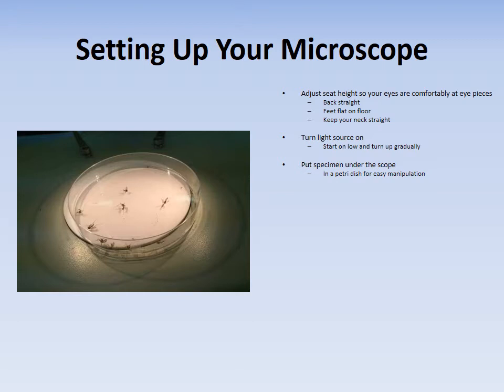You will be manipulating that mosquito when you're flipping it over, looking at the top, looking at the underside, things like that. But it's especially when you dump them out and you've got lots of mosquitoes on a petri dish, or you need to look at lots of mosquitoes at once. Having it in a petri dish that you can move around is very, very easy to do.